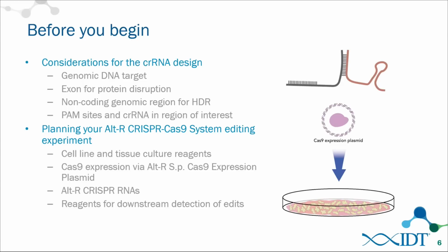Then some general guidelines as the end user may be entering into thinking of ways to incorporate, or reasons to incorporate, gene editing experiments into their own research. What we want to mention here, really before beginning the experiments and prior to ordering, are certain considerations that need to be made in terms of the CRISPR RNA.